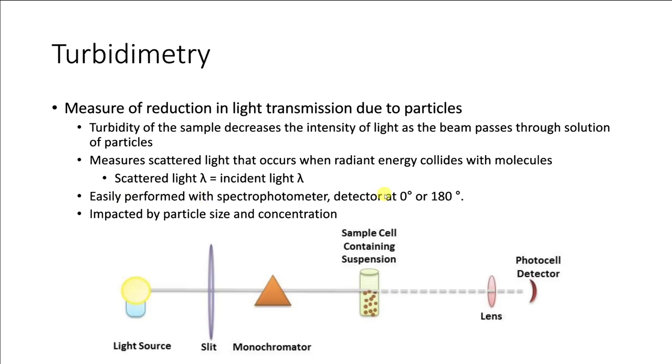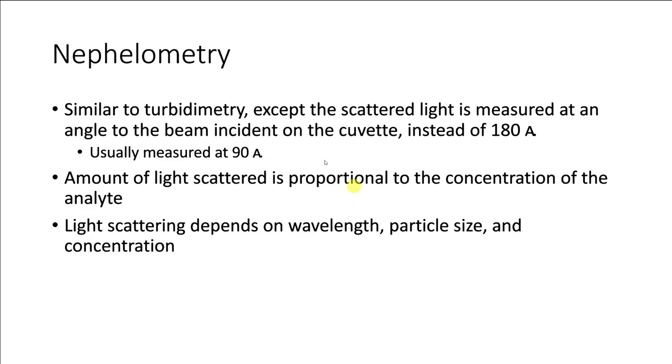We can easily perform this with a spectrophotometer, just placing a detector at 0 degrees or 180, basically in a straight line like this. And it is impacted by particle size and concentration.